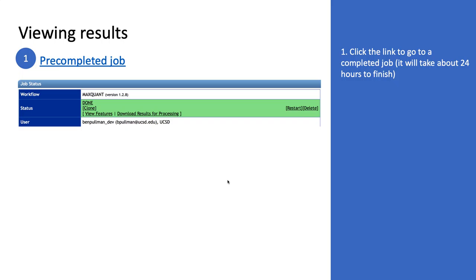But it gives you the ability to share results with collaborators, or if you want, in your papers, you can even put a direct link to the results that support your conclusions. So the link is sort of a permanent record for that job, for those search results, and it's something that you can share. Yes? As it is now, it is view only. There's nothing else you can do with it. You can download, and you can interact with it online in the sense that you filter, you sort, and whatnot, but you can't change it. So from that perspective, that's totally safe.